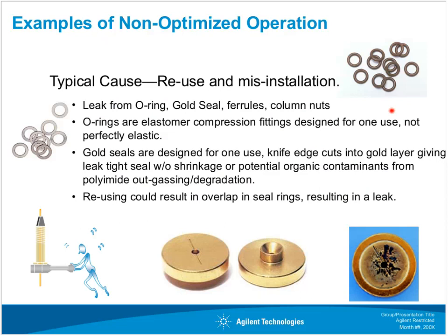If you do take out the liner and reinstall it because it looks clean, these are pliable O-rings that are on there. They may not seal as well the second time. They're also under heat for a certain duration, a week or month at a time, so that may deform them a little bit. The gold seals themselves, this is another thing that people take out and inspect, and if they see it nice and shiny like this, they'll reinstall it. Or if you don't look at them, I've had many customers that have actually taken them out and go, holy moly, look at all the stuff that's on the bottom of even the gold seal.